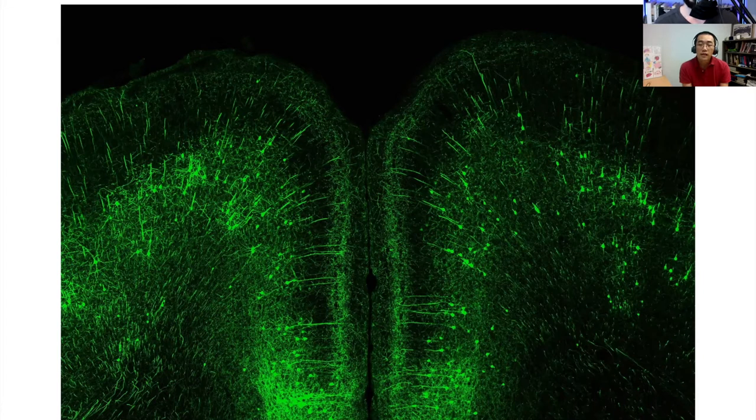And you can see also lines coming out of the circles. And sometimes the lines don't connect to the circle. But those lines, those fairly straight lines that radiate out from the circles, those are the dendrites of the cell body. So that's exactly where some of the synaptic input would come in for the neurons.